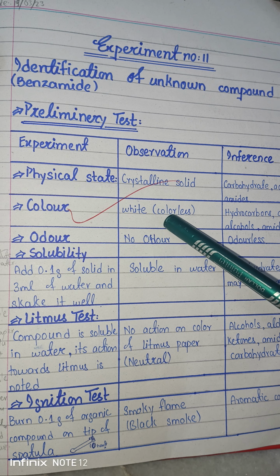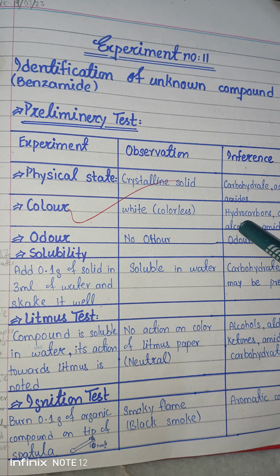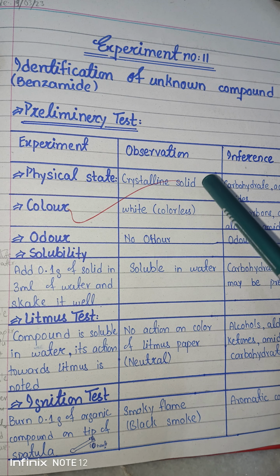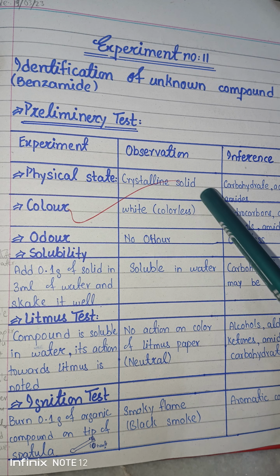colorless. So whenever we see white and colorless, some hydrocarbons, acids, alcohols and amides may be present. In benzoic acid, these same two conditions apply. Benzoic acid is also a colorless, crystalline solid.